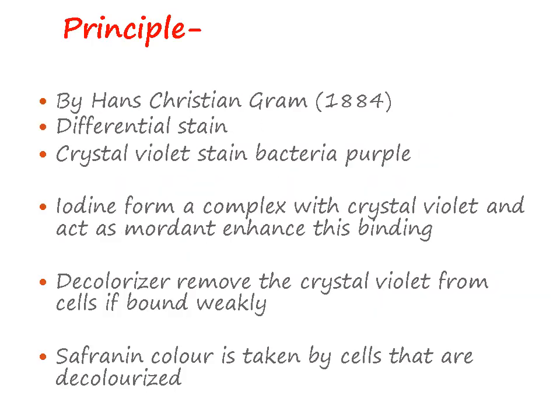So what is the principle of gram stain? It was first used by Hans Christian Gram, who was a scientist, in 1884. So basically gram stain is what? It is a differential staining technique. It will differentiate bacteria on two aspects, either into gram positive or gram negative.